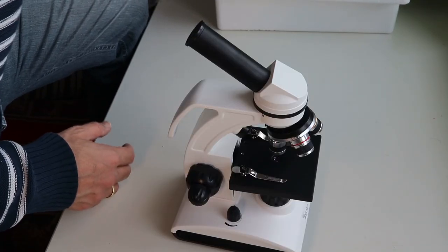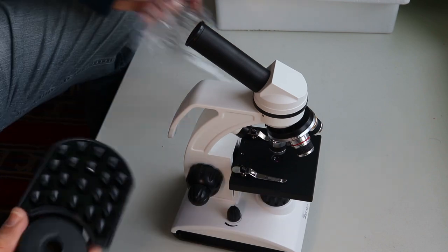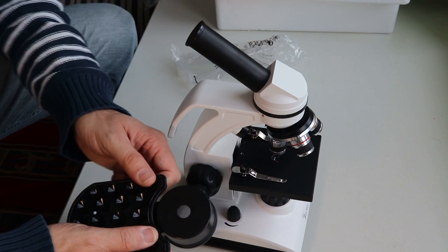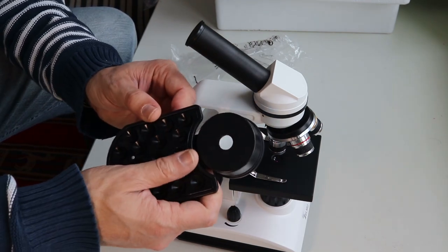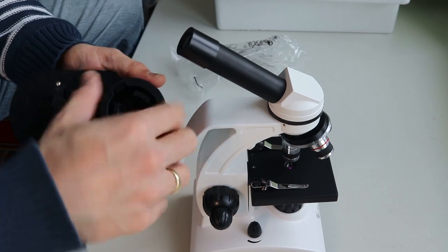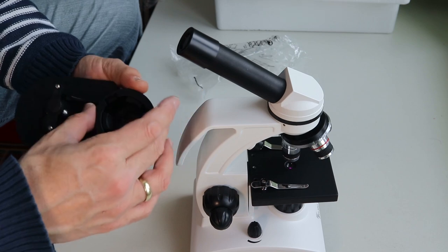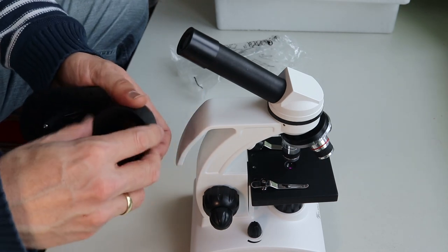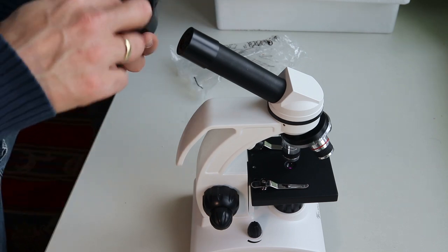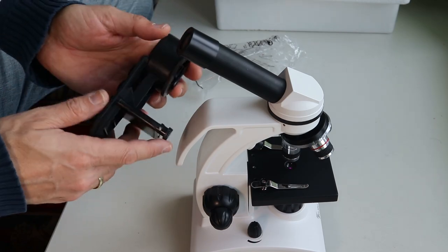I will also use this adapter here. Those suction cups are there to hold the mobile phone in place. I have to tighten it so that it fits snugly around the eyepiece. Okay, but what I'm thinking of is that I could simply get myself another eyepiece, put it in here, and then simply exchange it as needed.